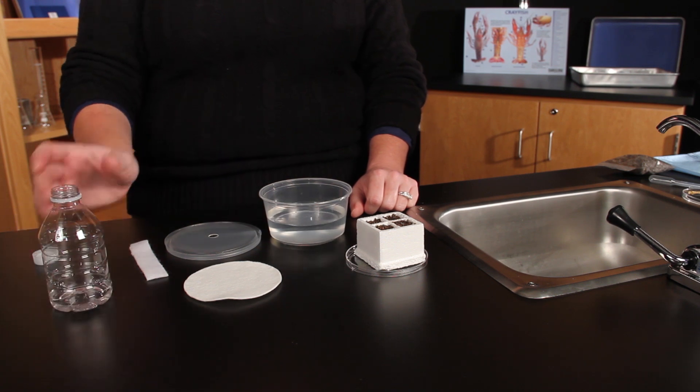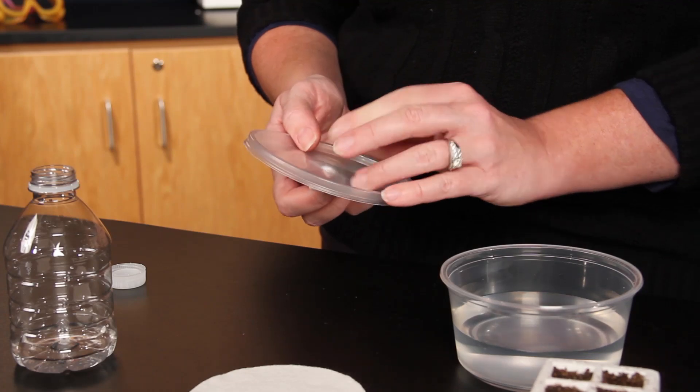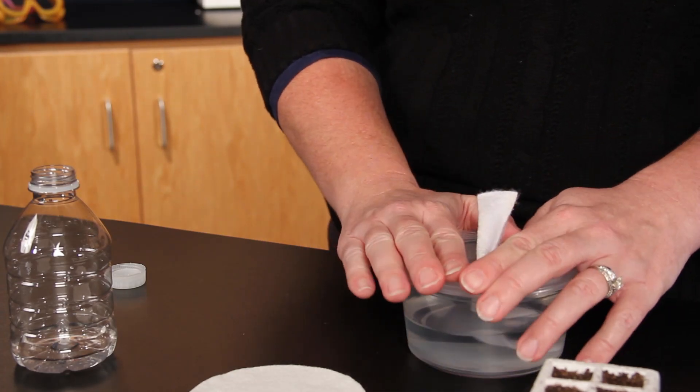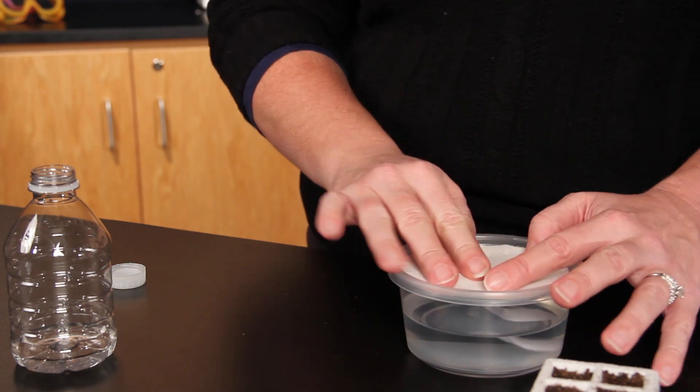Plants will need a continuous watering system and 24 hours of light at room temperature. A simple watering system can be created with 8 ounces of water in a deli container. Remember to add water when needed.